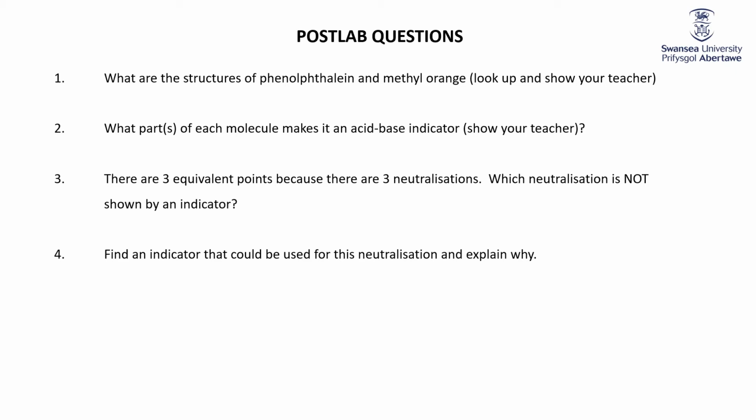And now look up and see if you can find an indicator that I could use for this titration, for the missing titration, and explain why you can use that indicator for it. What's the mole ratio of the sodium hydroxide to sodium carbonate in the mixed solution?